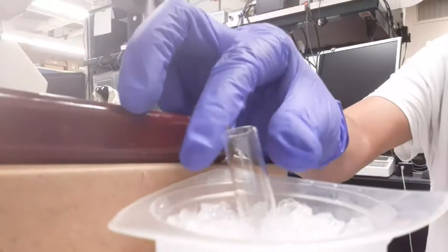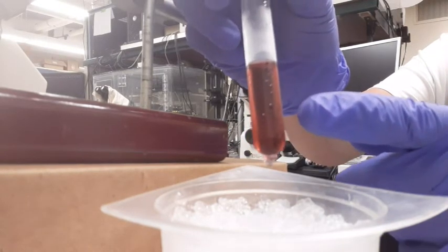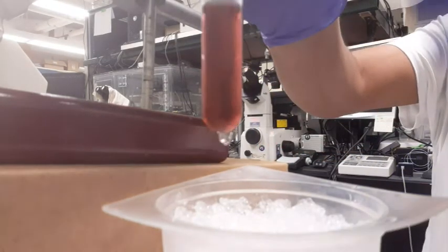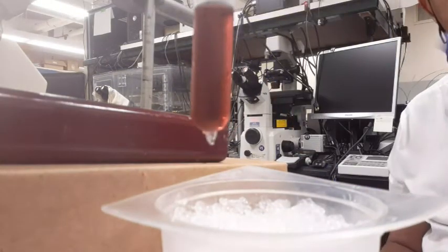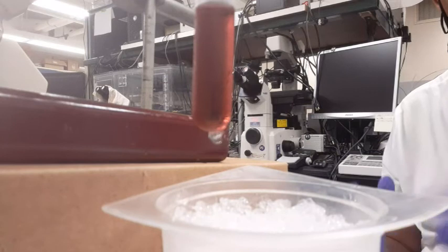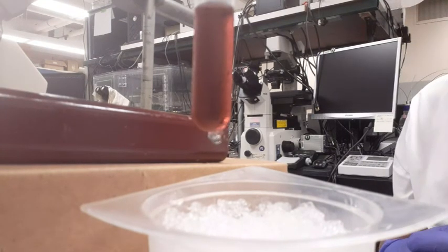As you can see, after cooling it, the equilibrium has shifted from the deep blue cobalt-2-tetrachloride solution back to the cobalt-2-hexahydrate solution, and the pink color has emerged. This reaction is exothermic going from blue to pink — that's why removal of heat generates the pink color faster.